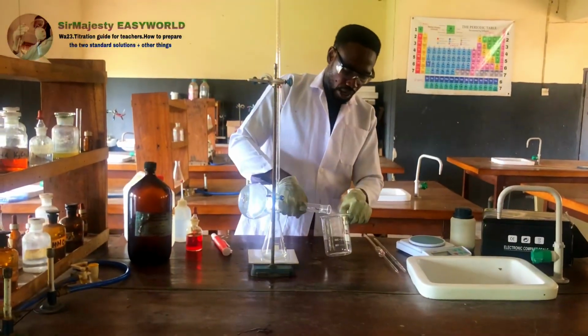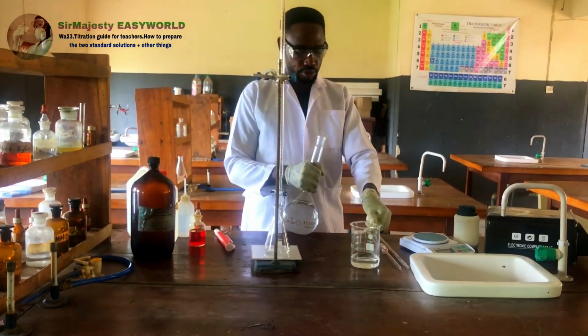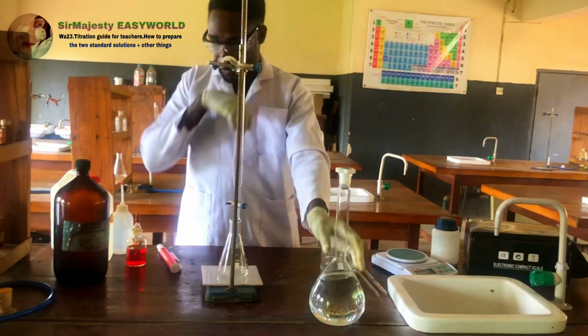So let me now bring out the one I will use. I think this is up to 15 ml. Here is the setup. I need the funnel to fill this.